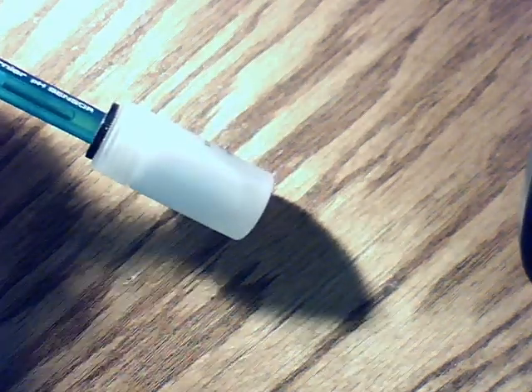You're going to be using a pH meter. When you pull it out of the box, it looks like this. Now, the container that it's in here — the tip of the pH meter is in — is what protects the pH meter.